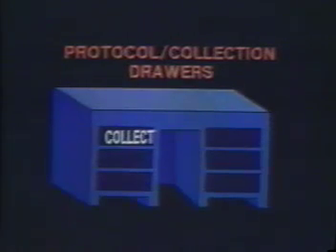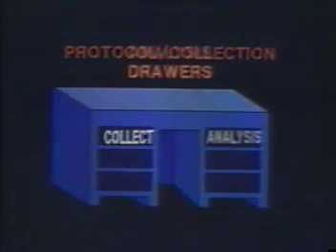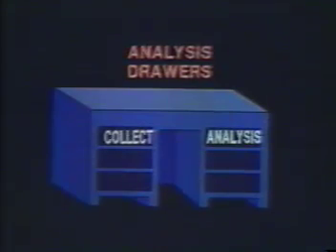Switching into collection mode will also cause an analysis drawer to appear on your desk. New analysis drawers are empty when they are installed onto your desk. Then, as you collect data for each sample, FACS Desk transfers the information from the sample label onto another type of card, which it places into the analysis drawer. These cards serve as a permanent record of the warehouse location of the data stored for each of your samples. When you analyze data, you use these cards to place your analysis requests.